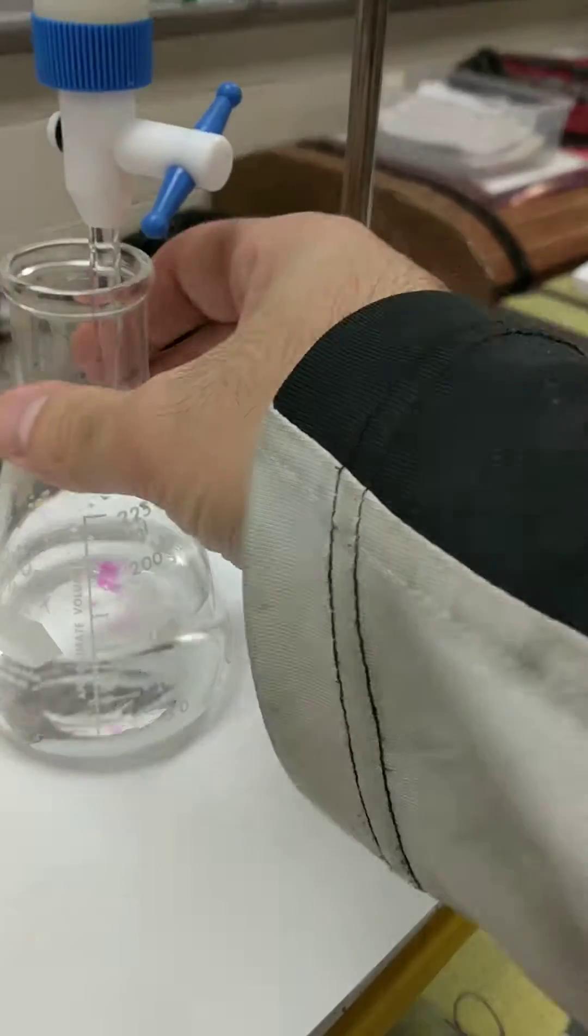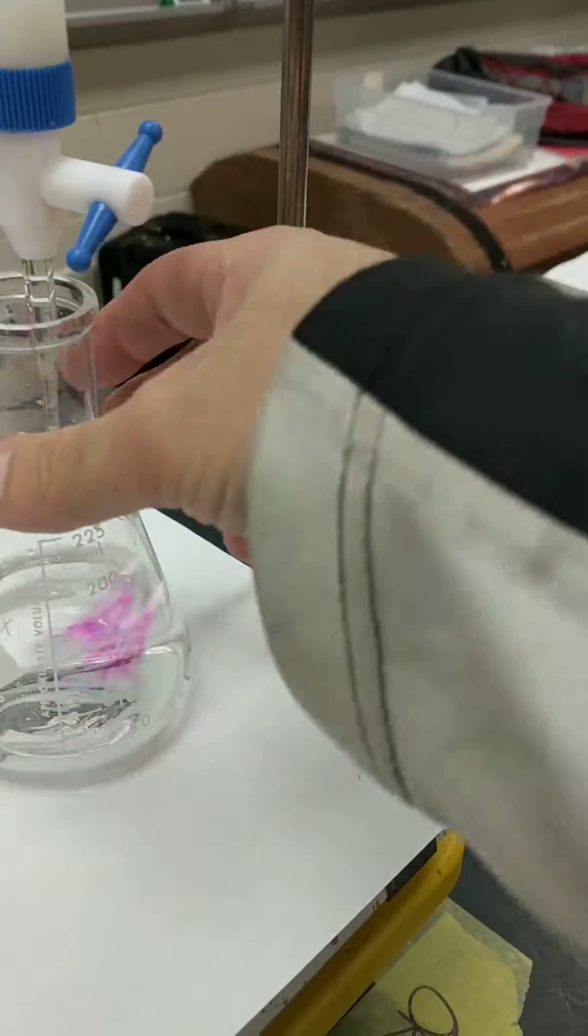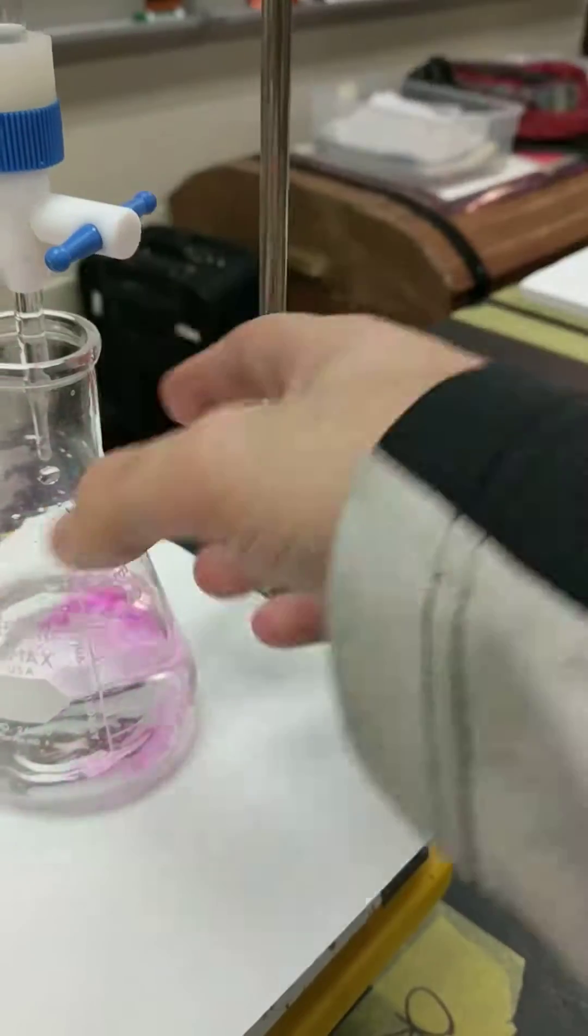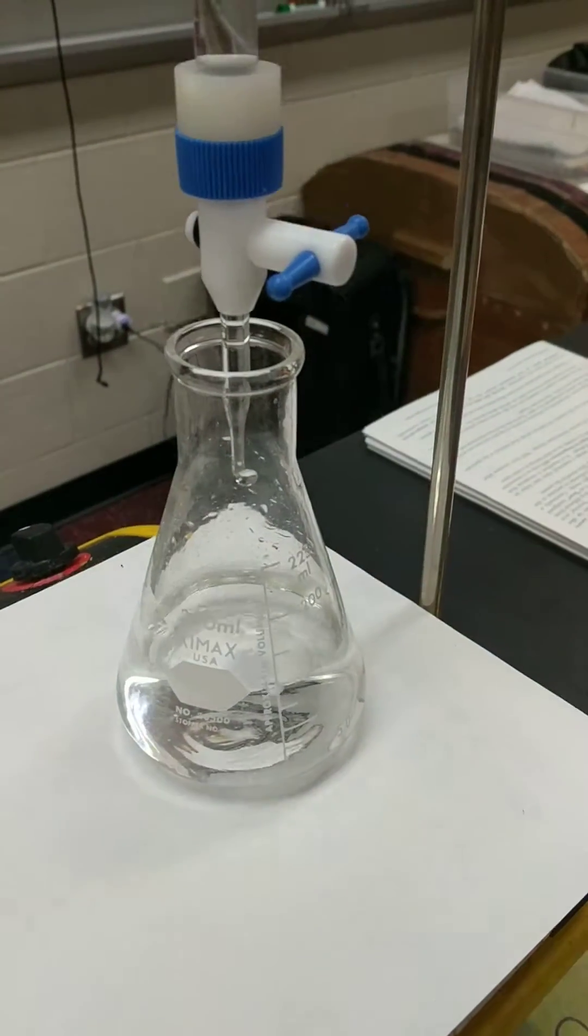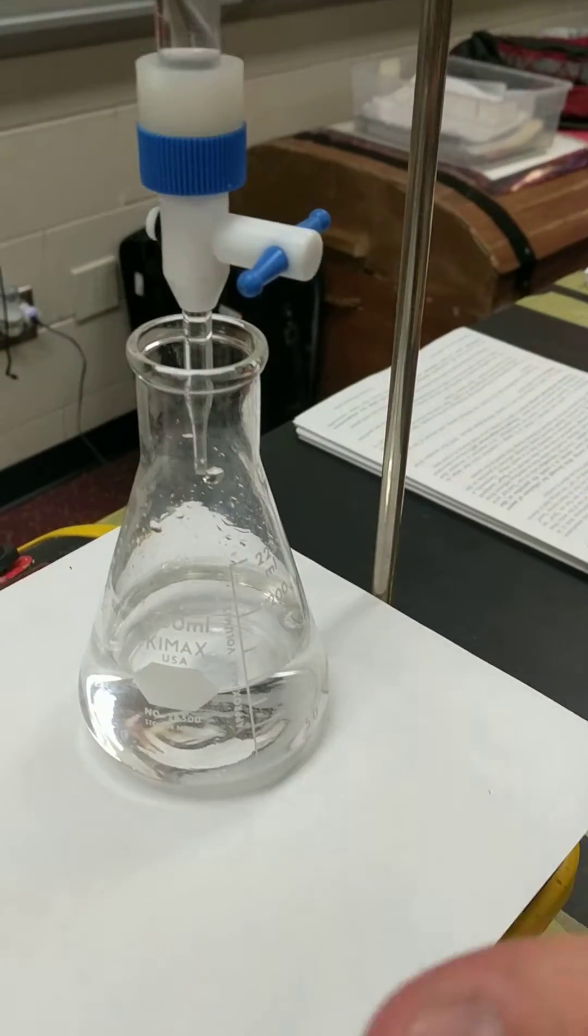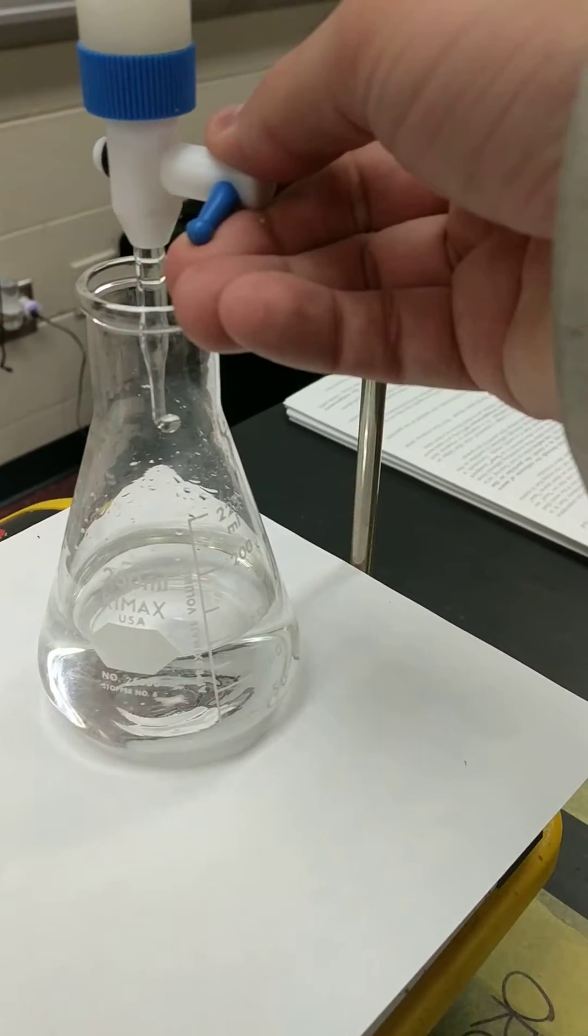So I'm going to do one, almost there, two, almost there, three, four, five, six, seven, eight, right? Look at the pink color, pink color, it goes away. That means I'm not at the endpoint yet, but it's getting there, because the pink color is lasting a little bit longer.